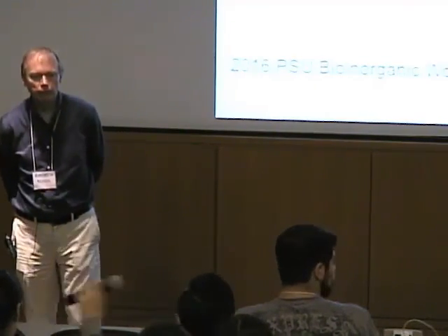Any further questions? I might have missed something about how you assign the magnetic axis to the molecular directions for a single crystal EPR? Yeah, so that comes out of, I showed you this transformation of the matrix, right? So if we can measure our rotation patterns, and we then have to do this diagonalization.